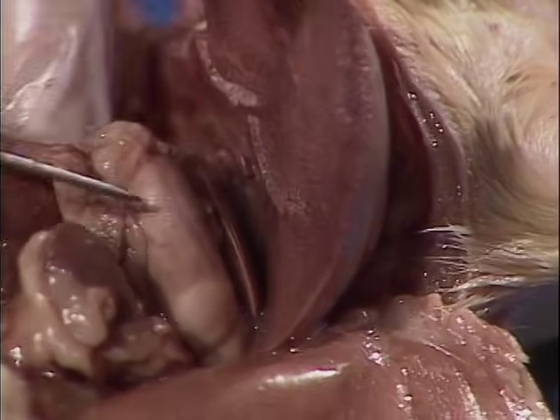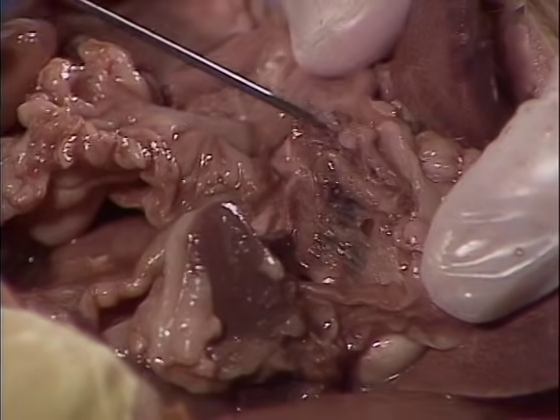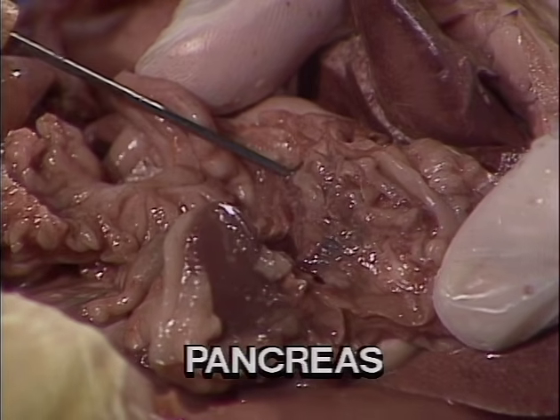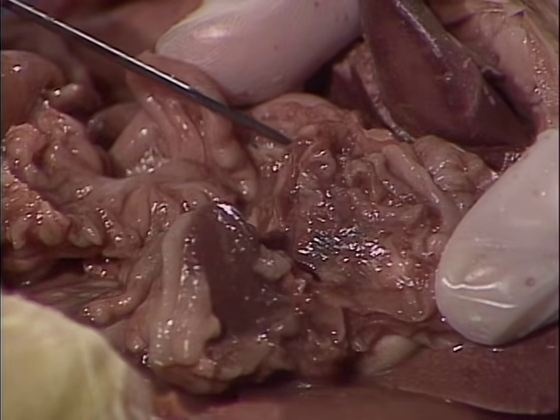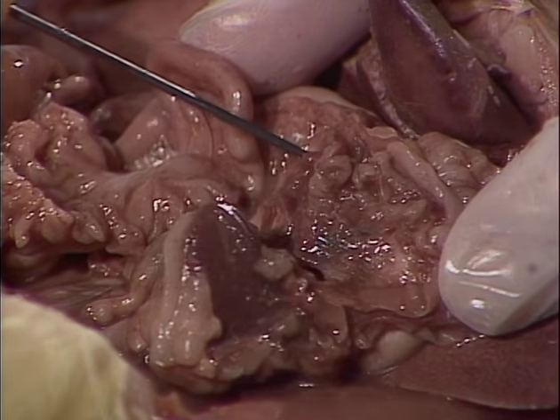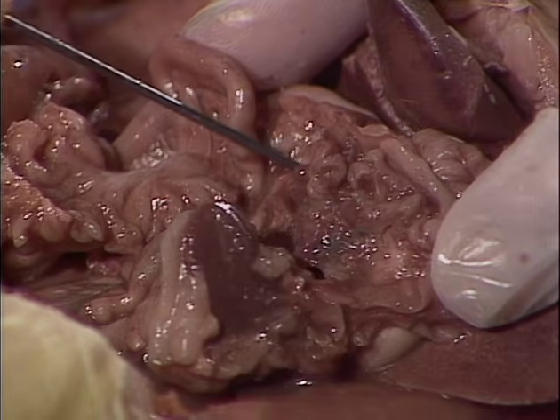Between the stomach and the small intestine is a diffuse gland, which is called the pancreas. The pancreas produces enzymes and hormones. The digestive enzymes produced by the pancreas are secreted into the duodenum. The hormones are secreted into the hepatic portal system, where they are involved in blood glucose regulation.